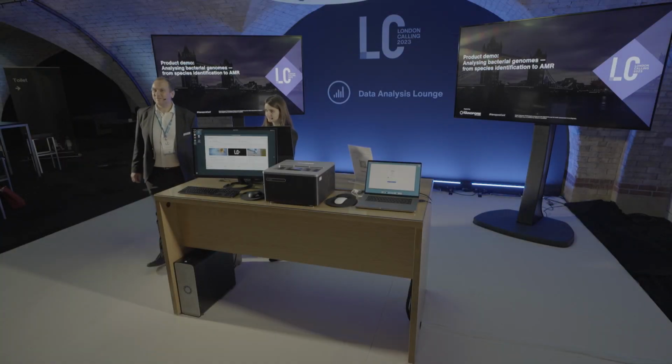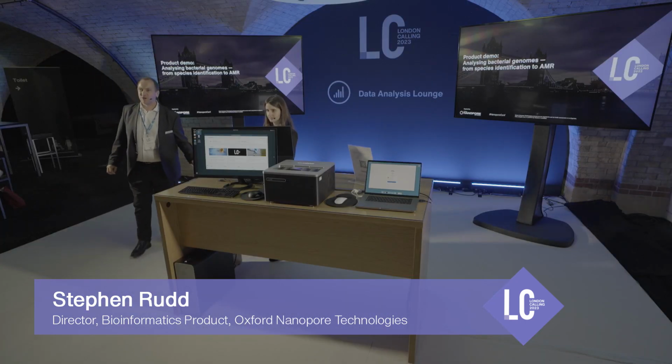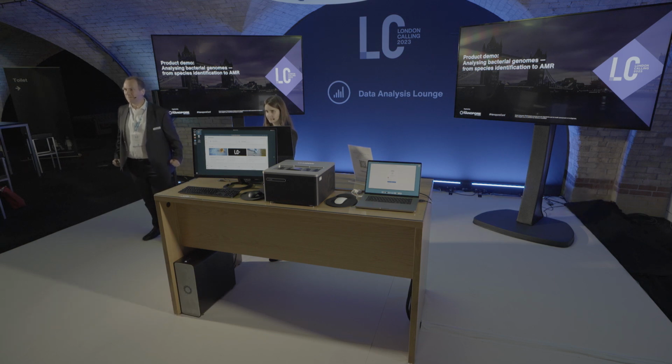Good afternoon, folks. Thank you so much for joining us in our glorious bioinformatics cave. I hope you had a good lunch, and I hope you're ready for a couple of enthusiastic minutes of a little bit of microbial genomics. So everyone looking forward to this? Yay, awesome. That's what we like, a little bit of team engagement.